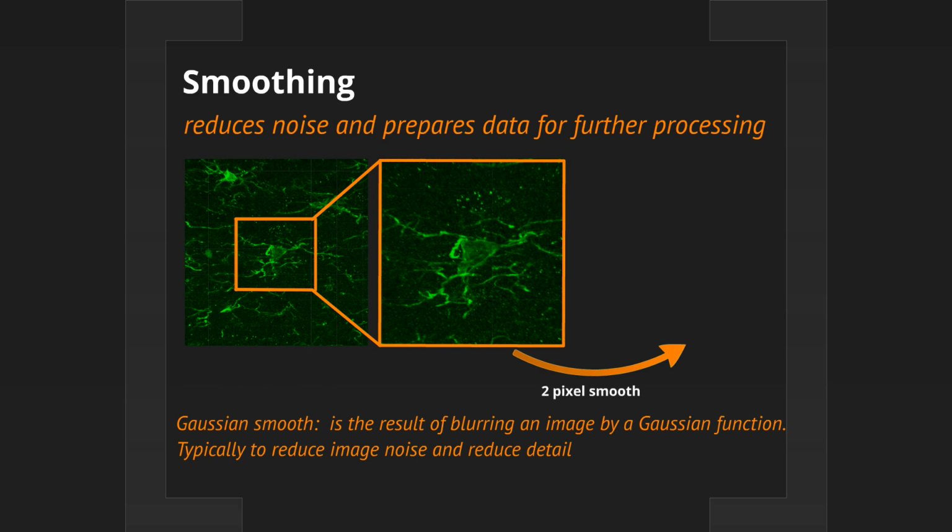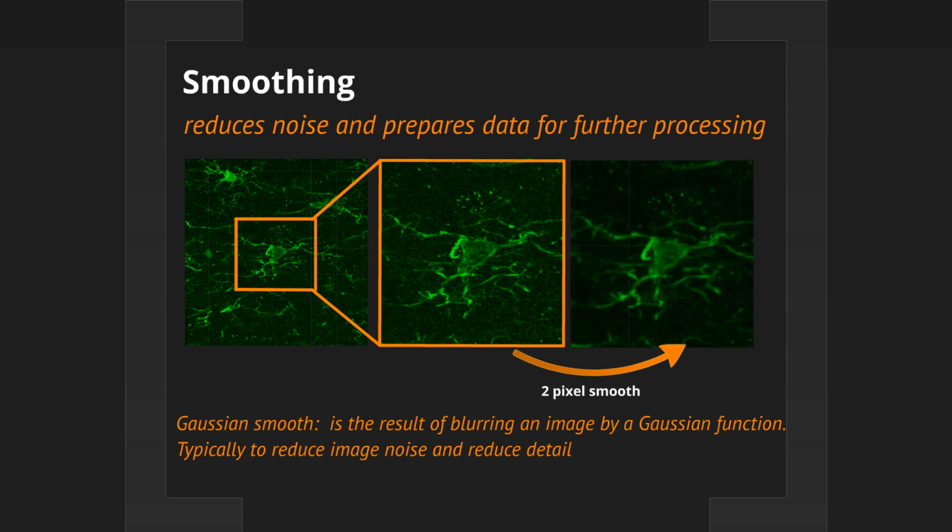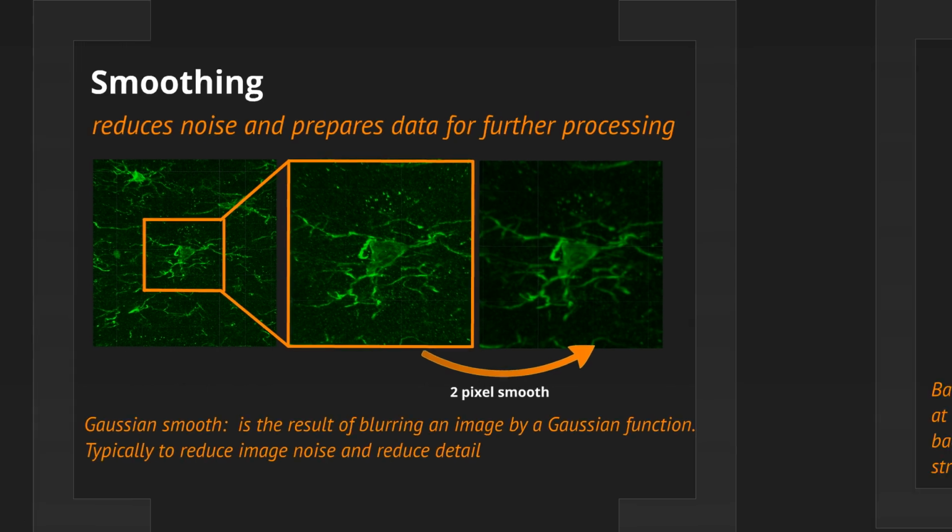So we provide smoothing filters. The one that we typically use is a Gaussian filter. It basically blurs the image based on a filter width that you can enter. The default filter width is 1 pixel in diameter, so that basically does a 1 pixel smooth throughout that 3D volume or 4D volume. So this one I highly recommend. If you can visualize noise, it's a good idea to get rid of it. Okay, so a Gaussian filter I highly recommend.